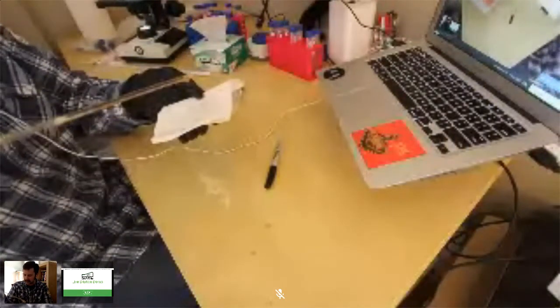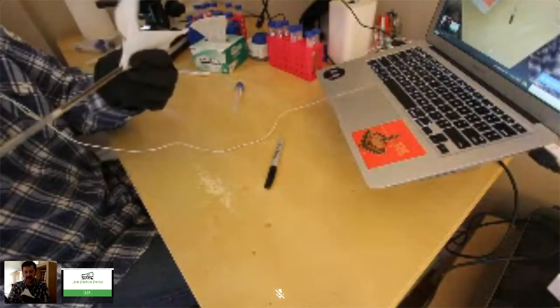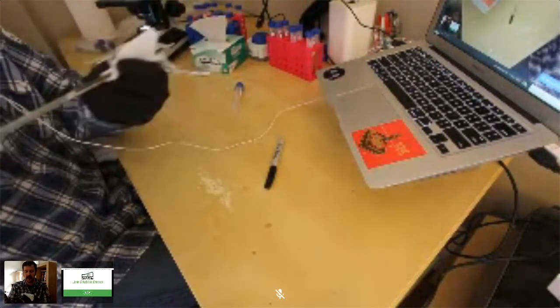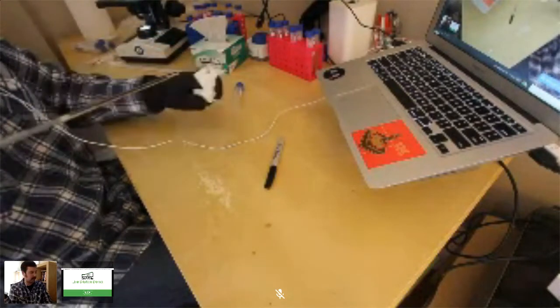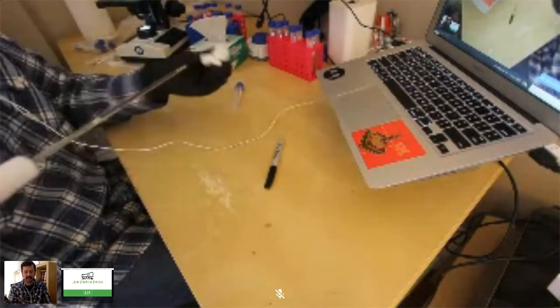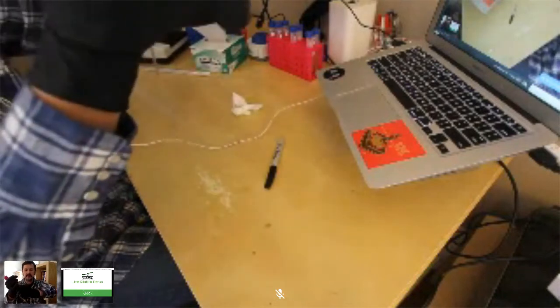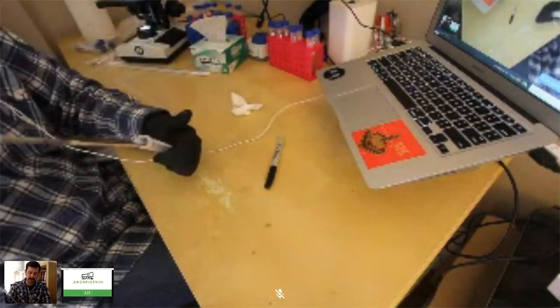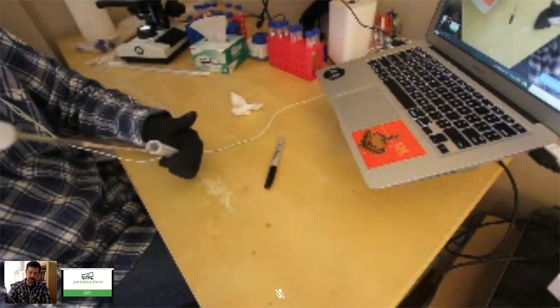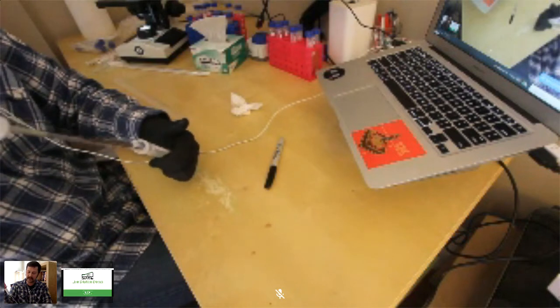I'm getting a bunch of stuff falling off. So another thing to be aware of is these pipette tips are low quality. So I'm definitely not going to get a 1 in 100 sample in there, but we can correct for that. So anyway, wipe your pipette tip off. This gets all the yeast off of it. And then you will take your sample, insert it into the water, and then pulse it back and forth to rinse off the inside of your pipette to get the rest of the slurry out.